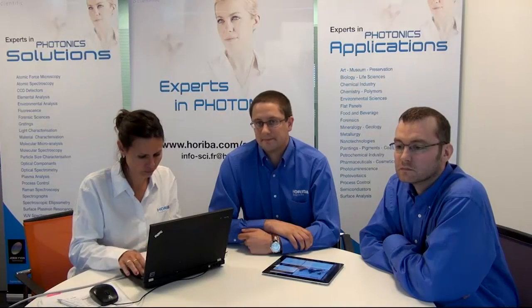Someone asked if it was possible to do the same analysis with the Dual-FL and with the Aqualog. Yes, from the purely hardware point of view, there are the same kind of specifications, and the optical design is the same.